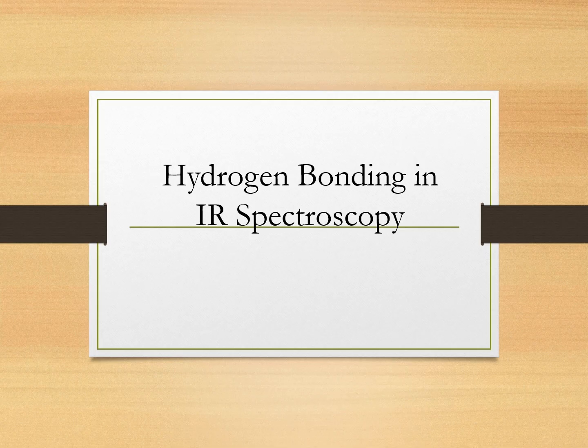Today's presentation focuses on one of the most fundamental and powerful concepts in vibrational spectroscopy, hydrogen bonding and its signatures in infrared spectroscopy. Today we will explore how hydrogen bonding affects IR frequencies, peak shapes, molecular interaction, and how IR can be used to identify intermolecular and intramolecular hydrogen bonds in various functional groups.